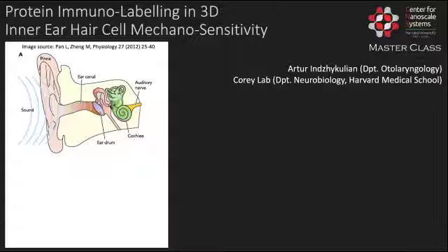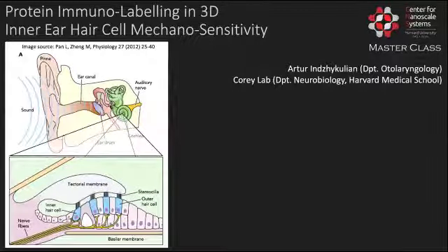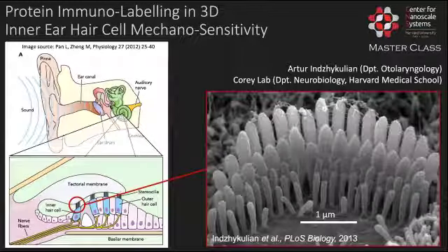To give you an impression of how small the dimensions are that we're working in, I want to guide you a little bit, as well as I can, to where we can find these objects. So we are in the cochlea at the end of the ear, where you have inner and outer hair cells, and sticking out of the inner hair cells, you have these beautiful cilia, which are used to measure the acoustic wave and translate those into electric signals.